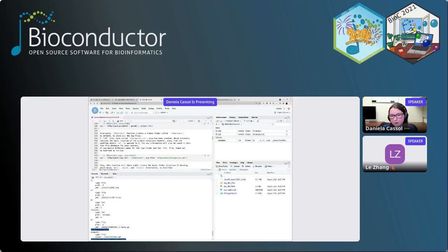The other file I'm specifying is this YAML file, in YAML format, where I'm basically saving the entire SPR object in this flat file database. That would be super simple to recover and then restart the workflow later on if anything happens. So all the information is safe here. Every time we update this SPR object, that information will also be saved in this flat file database.